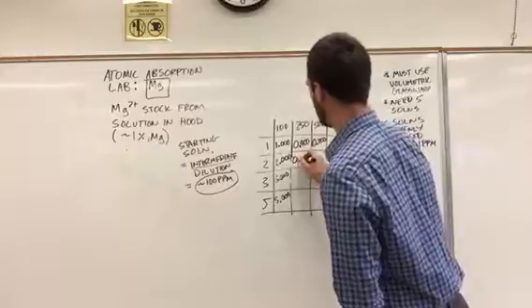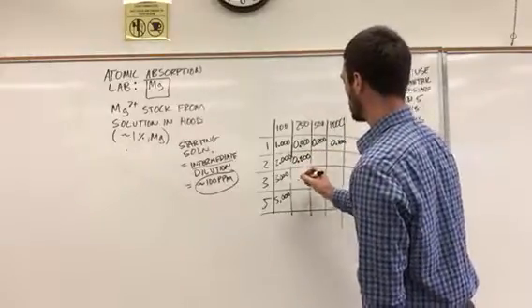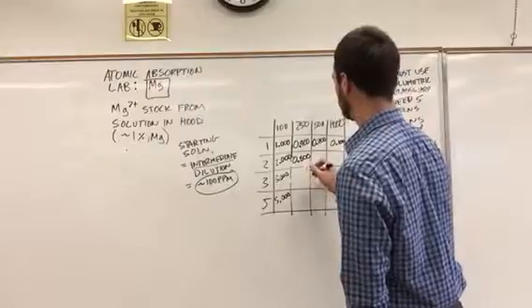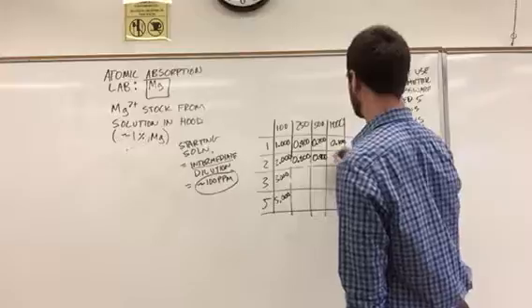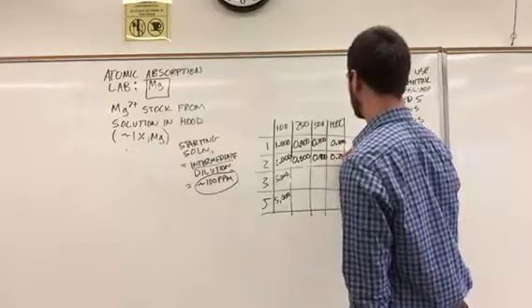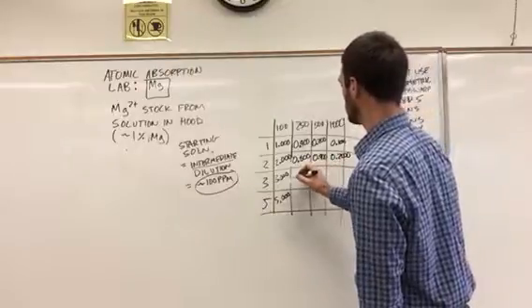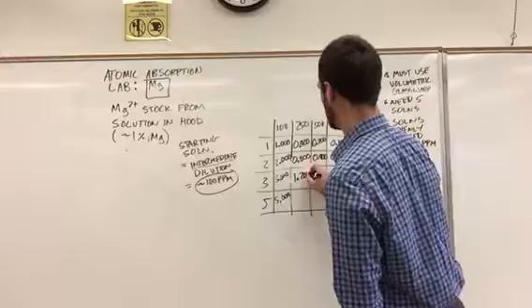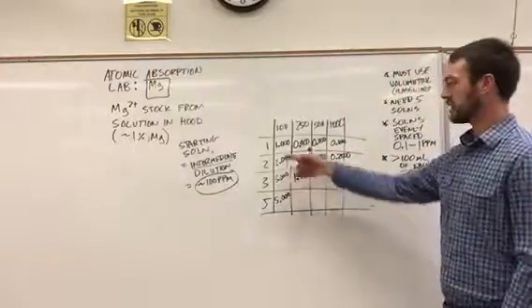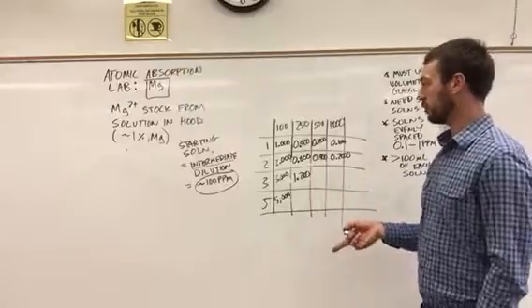So you can see that we can complete the chart fairly easily. And again, we can see that we can stop after we go too far, right?